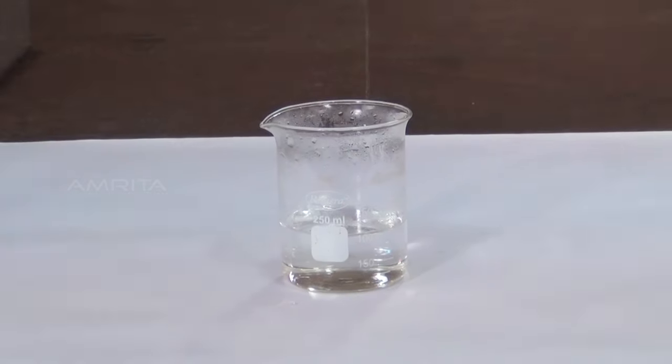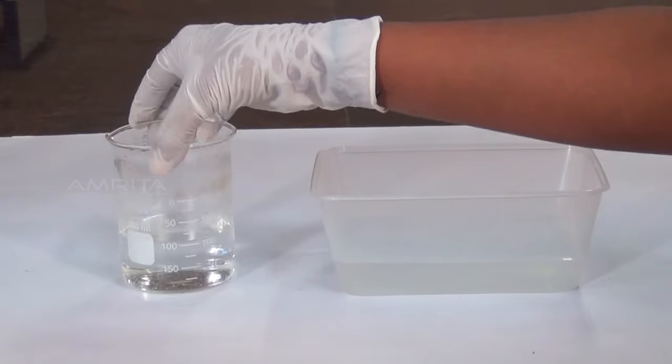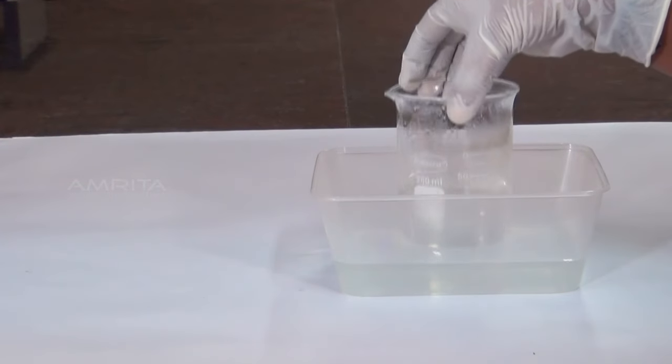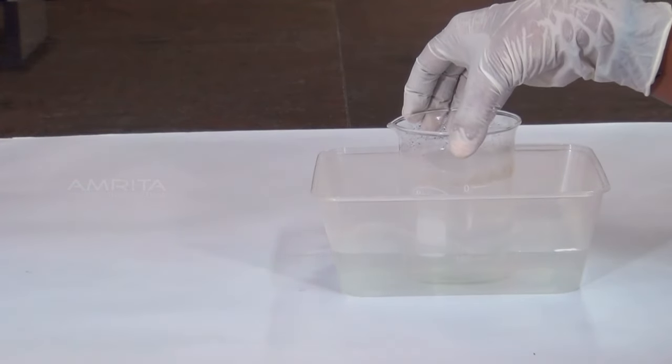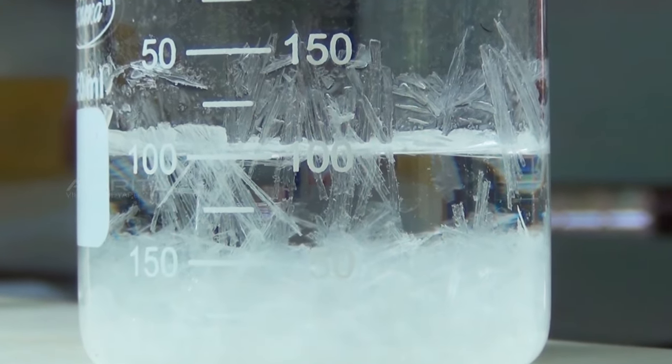Cooling the hot saturated solution. Let the filtrate come to room temperature by itself. Cool it by placing the beaker in the trough containing cold water. As the solution cools, white crystals of benzoic acid begin to separate.